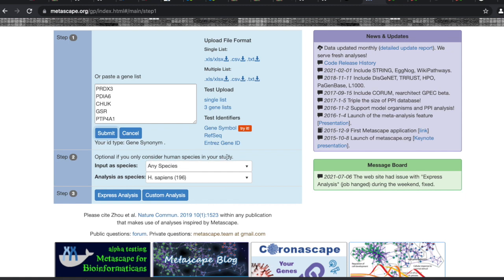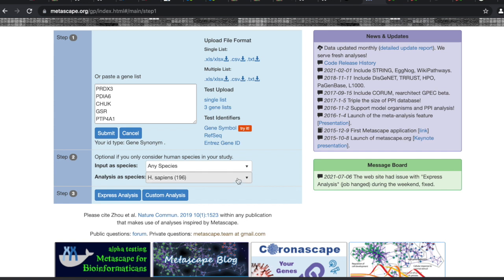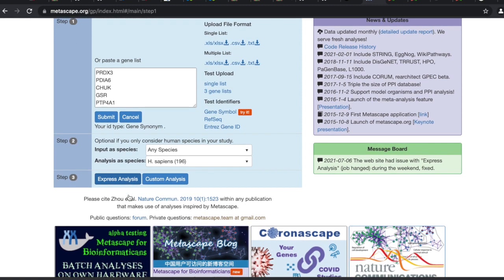Optional: if you only want to consider human species, let's go just human. Human's fine. And then hit Express Analysis.